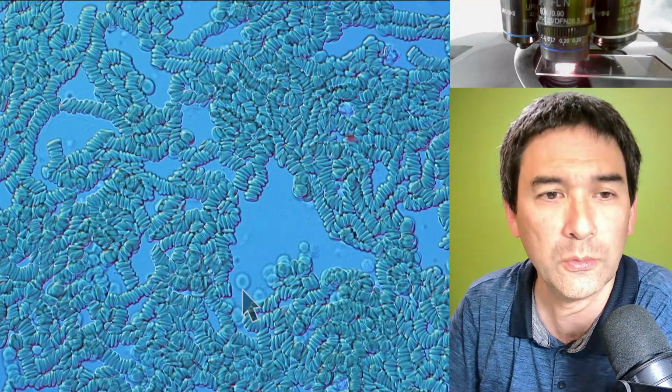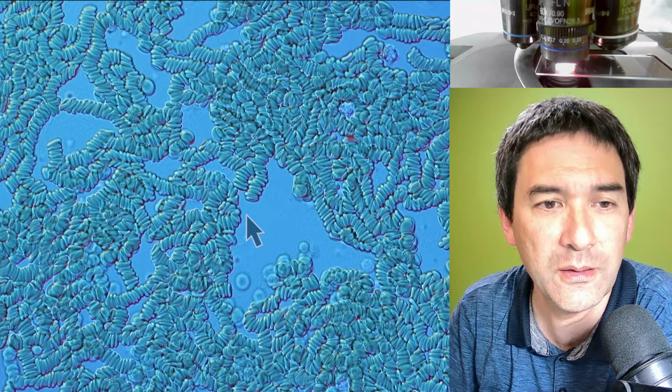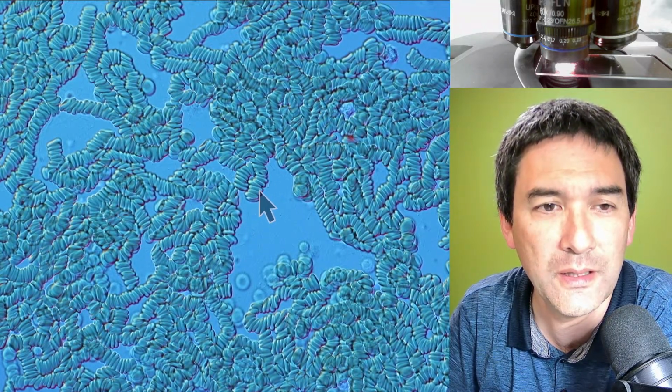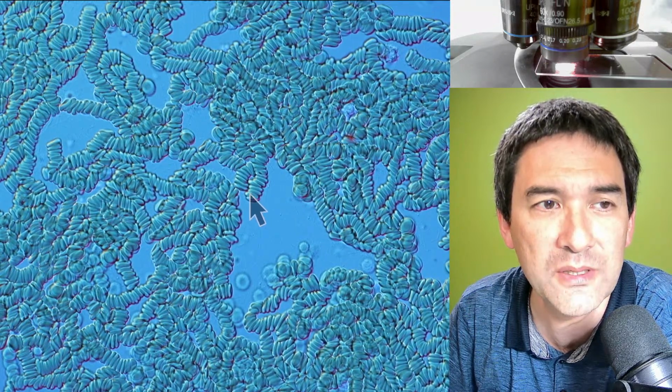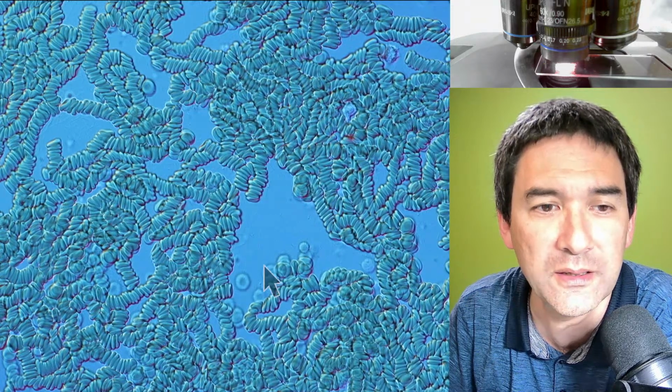It's something totally normal when blood starts to coagulate, because the red blood cells have a disc shape. For this reason, they like to stick together, and sometimes they aggregate by essentially stacking up like a stack of coins.